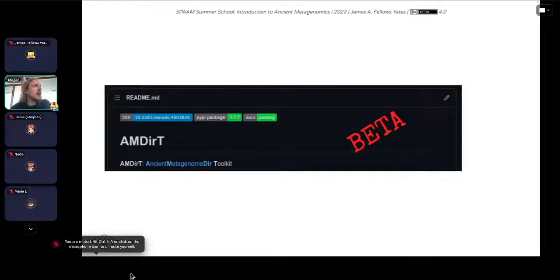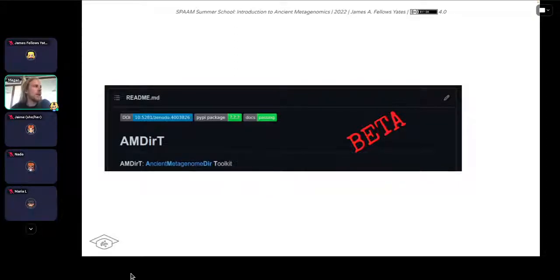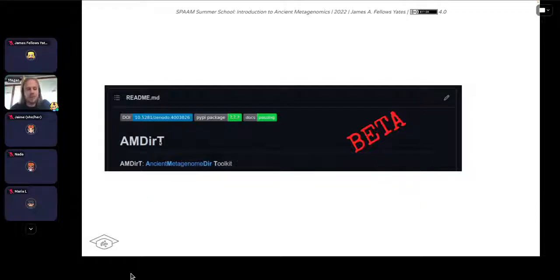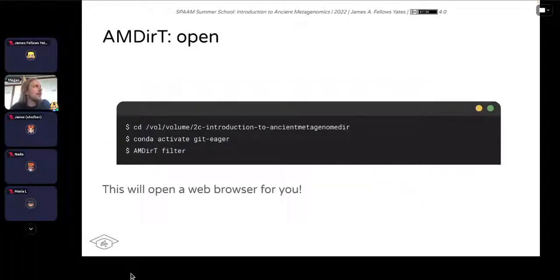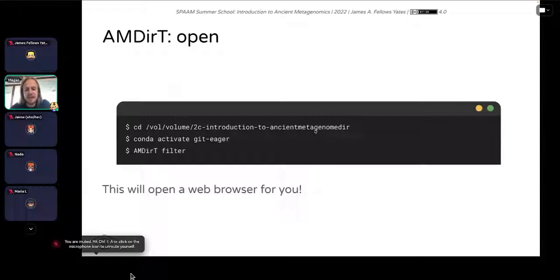What we're going to look at today is this new download tool, AMDirty. It's in beta — not released yet, but relatively stable. If you want to install it yourself, you can go to the AMDirty repository under the SPAAM community GitHub organization. I'd like you to go to the directory: cd /vol/volume2c/introduction-to-ancient-metagenomics-dir. If you don't have this because you're still downloading the EAGER data, you can go to your downloads directory instead.